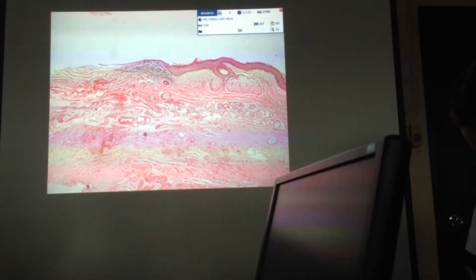And then the third classification for teratoma would be the immature teratoma. Okay? In immature teratoma, you do not see mature elements. What you see would be undifferentiated cell lineage, and then the characteristic feature that should be seen would be the presence of neuroepithelial tissue. Okay, pag nakita nyo yung neuroepithelial tissue, tingnan nyo lang sa book.